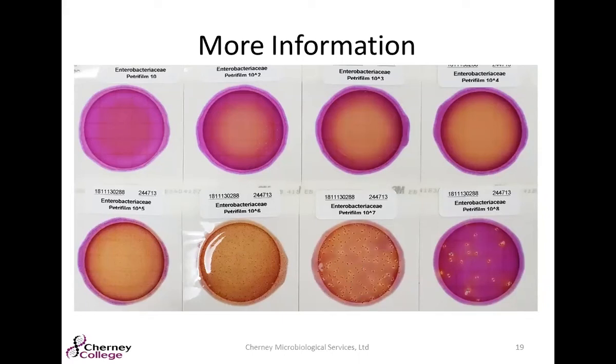I just want to state the importance of doing these extra dilutions. If somebody was inexperienced or in a rush, someone looking at that 10 dilution originally could see that this just looks purple and they don't see any defined colonies, and could call that a less than 10. When in reality, if you have extra dilutions, you can see that this ends up being over 100 million. So it's a huge misinterpretation, but I just want you all to be aware of how important these extra dilutions really can be.